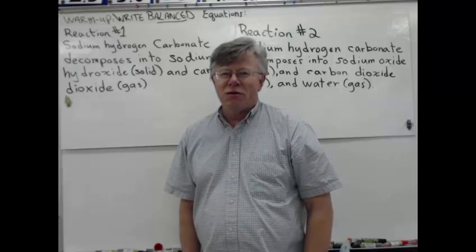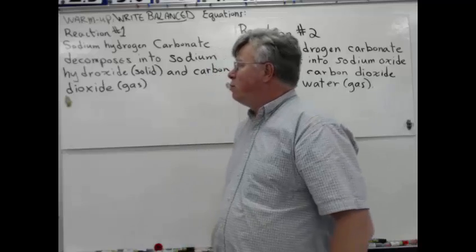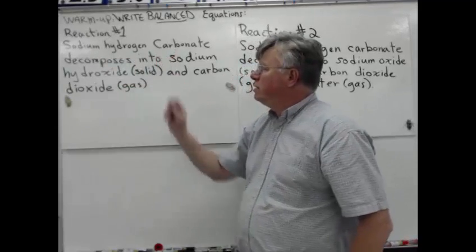Professor Kleinium is going to describe for you a lab we did recently in class. This lab was on the decomposition of sodium hydrogen carbonate.